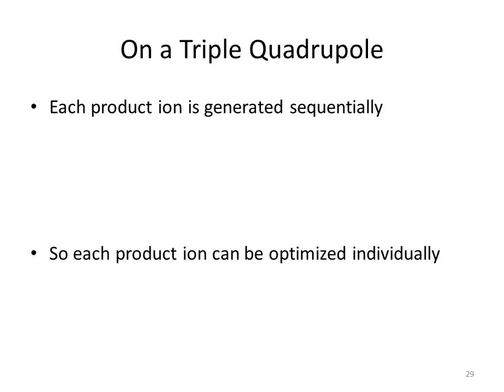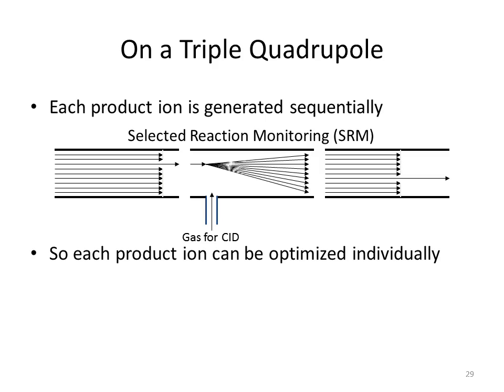Okay. All right, so optimizing collision energy. We've got 15 minutes, okay. Why do we optimize collision energy? People using triple quads, do you optimize collision energy for your stuff? How? Do you infuse it or do you do LC separation? LC. Okay, yeah, that's the new way.